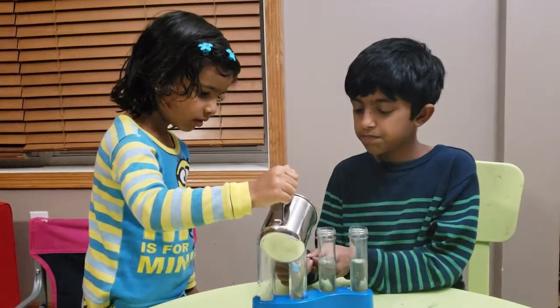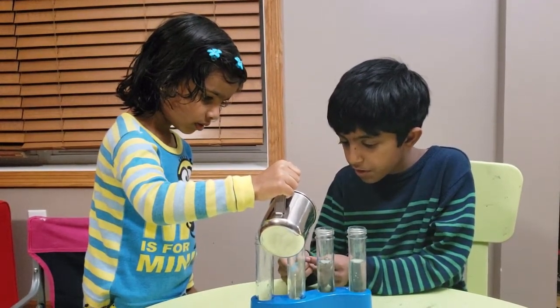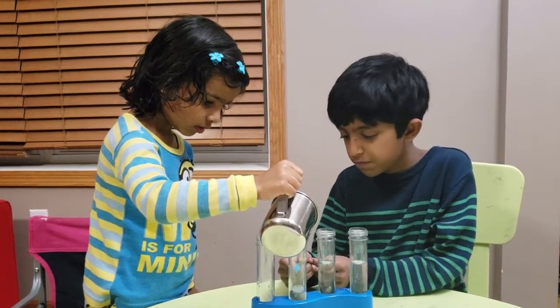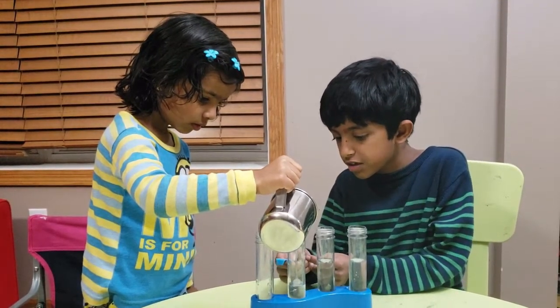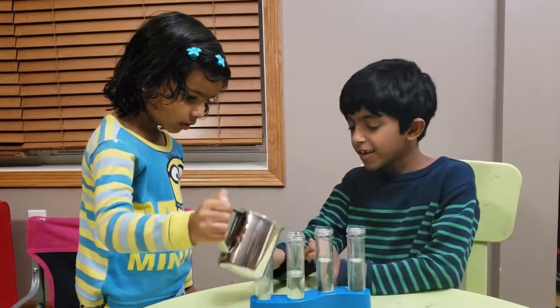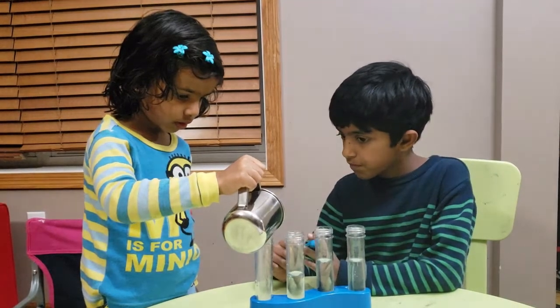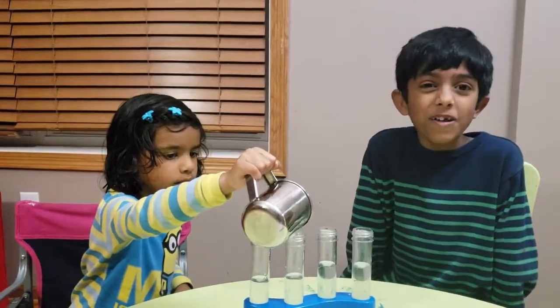Now in the next one — a little more, more, more, and stop. A little more still and stop. Now in the next one. So now it's all done.